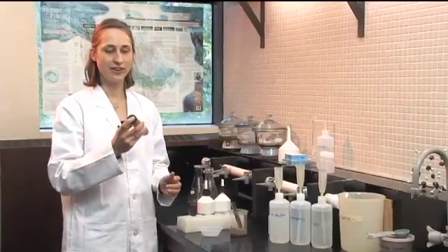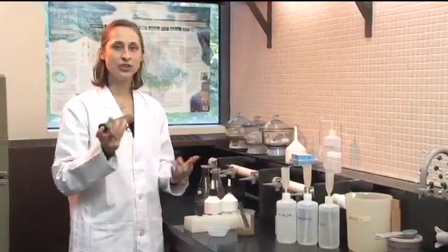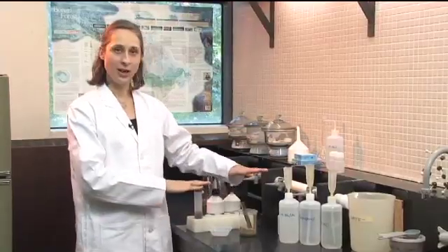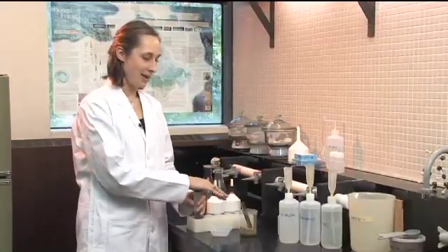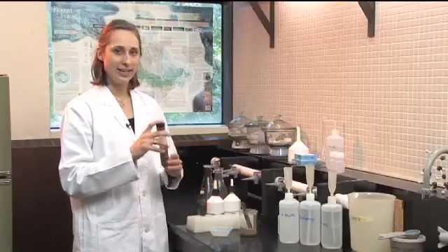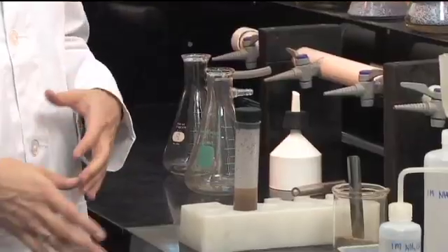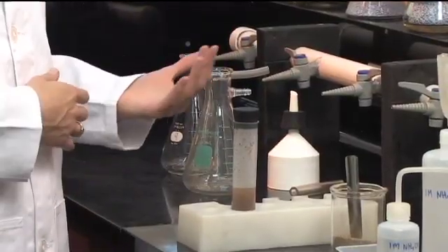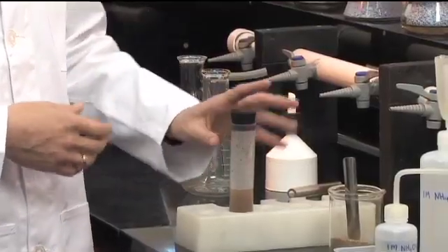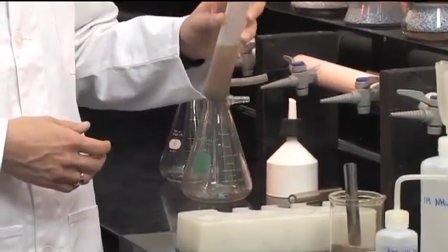We want that to shake for about five minutes. If you're doing a lot of these samples, you want to line them all up in your tray and put them on an automatic shaker. Then you want to let it stand overnight. The next morning we're going to shake them up again for 15 minutes.